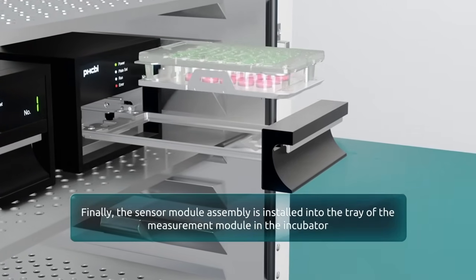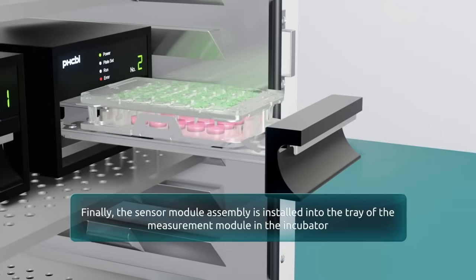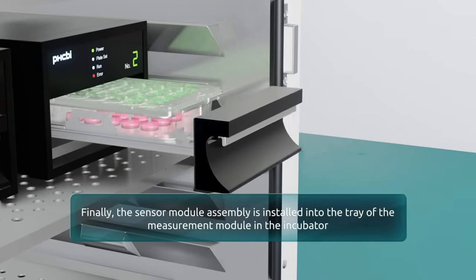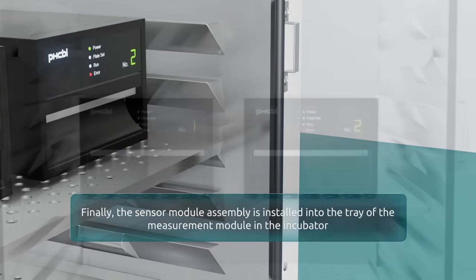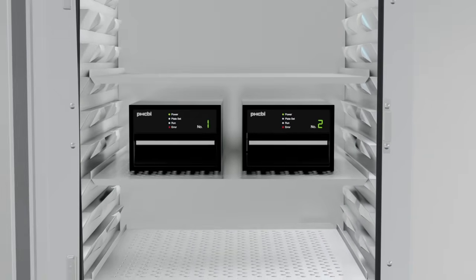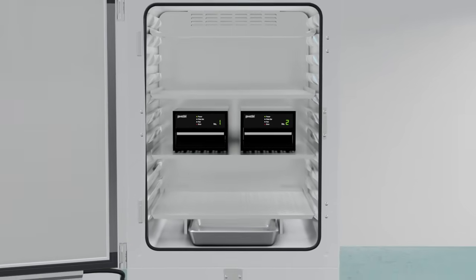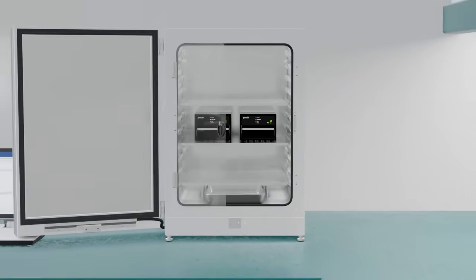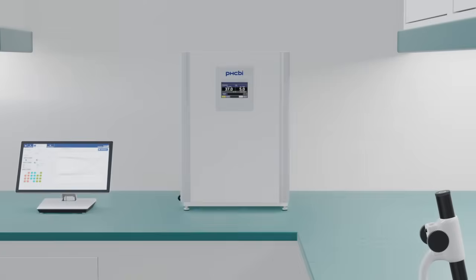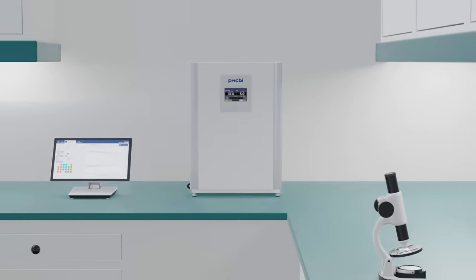Continuous measurement data can be viewed on the controller display. Continuous analysis of cell metabolism offers the ability to visualize the state of cells in real time, creating opportunities for unprecedented new discoveries in cell metabolism and cell and gene therapy process development.